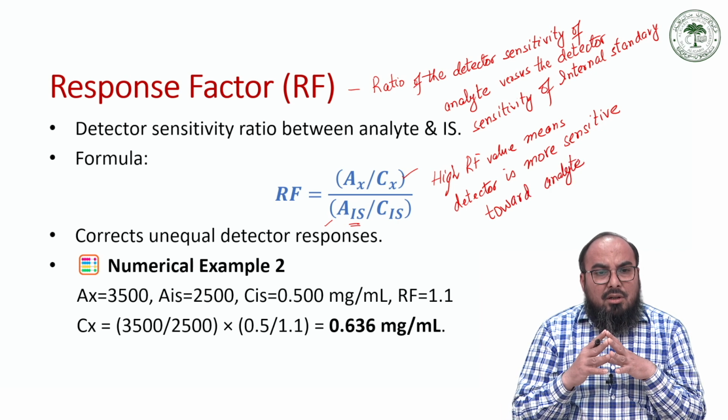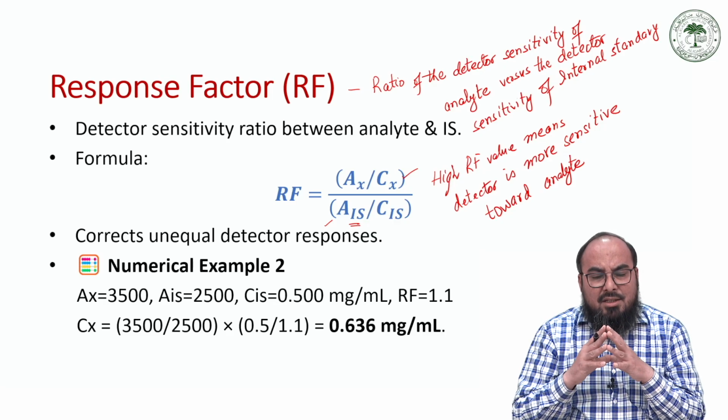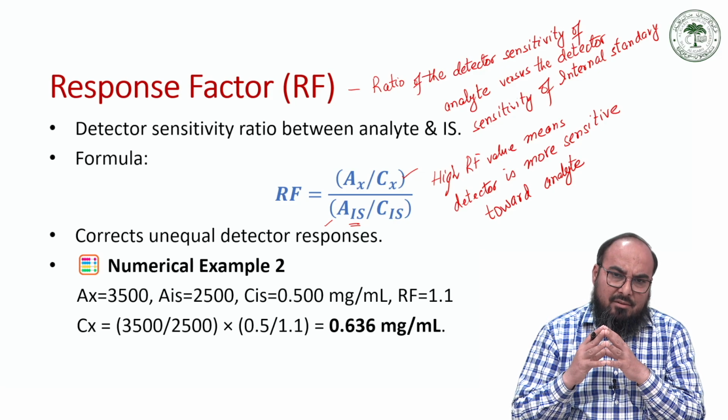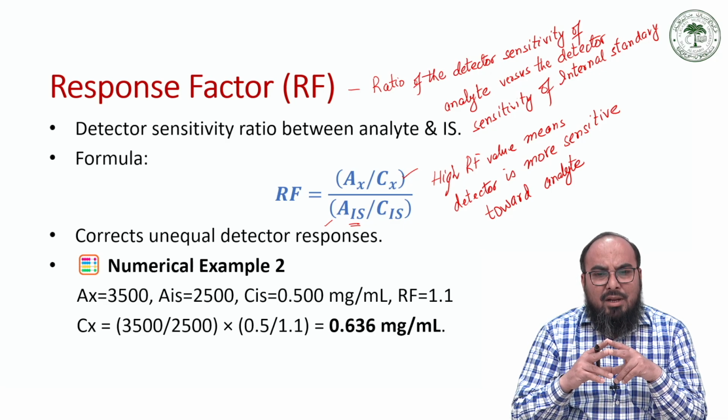So this response factor also corrects the detector responses. For example, if you are changing your detector, then the difference between the two detectors can be minimized by this response factor. Okay, so let us examine a numerical to get a clear picture.